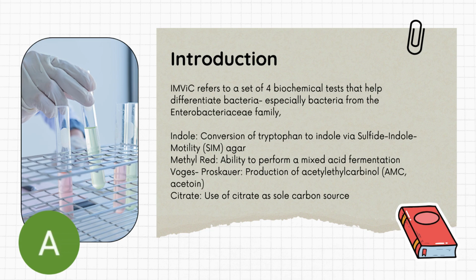To begin, IMViC refers to a set of four biochemical tests that help differentiate bacteria, especially bacteria from the Enterobacteriaceae family. The indole test ultimately tests for a bacteria's ability to convert tryptophan to indole with the presence of a sulfide indole motility agar. Methyl red tests for the ability to perform a mixed acid fermentation. The Voges Proskauer tests for the production of acetylethylcarbinol. Lastly, the citrate experiment tests for a bacterium's ability to use citrate as a sole carbon source.